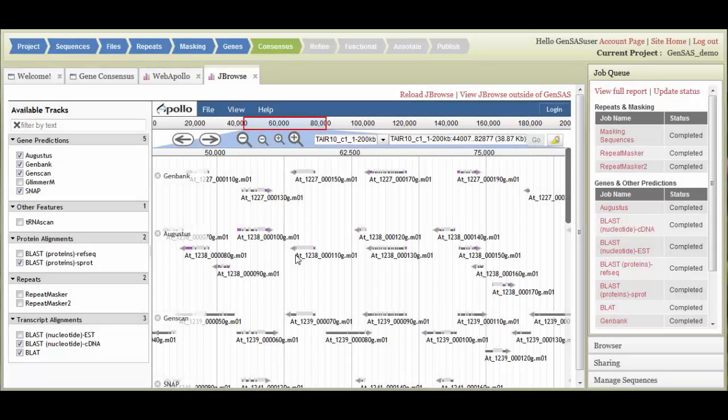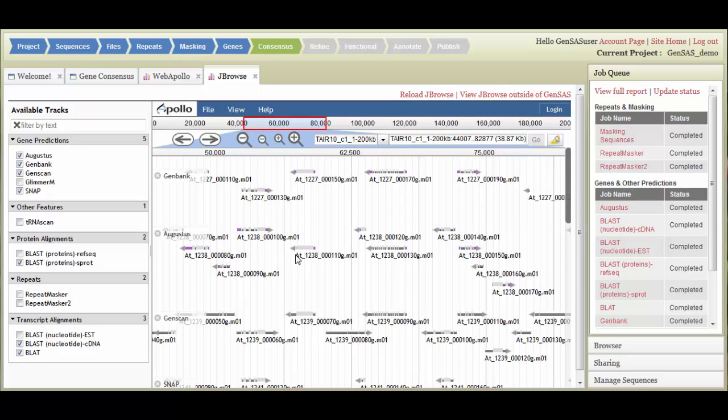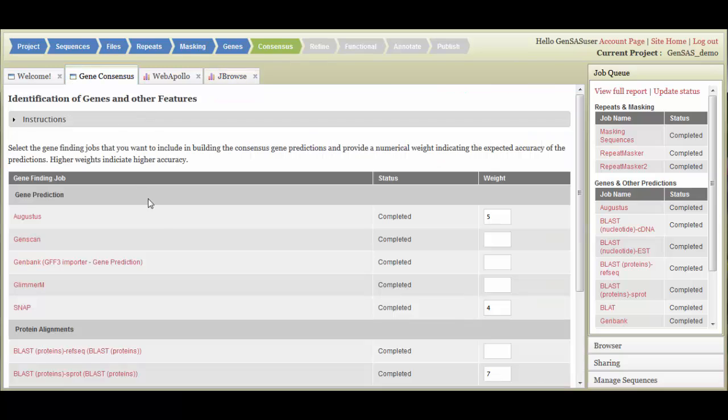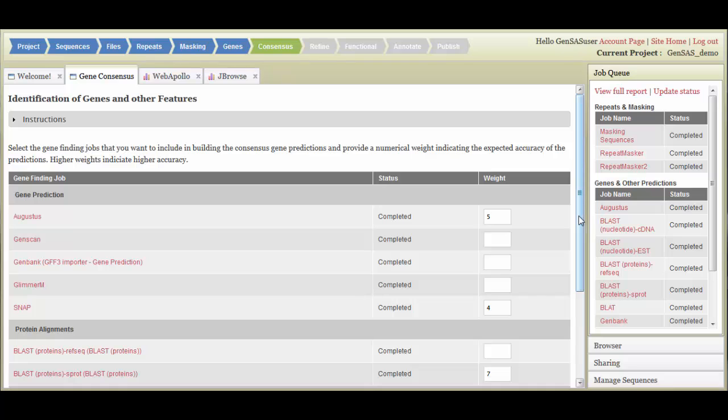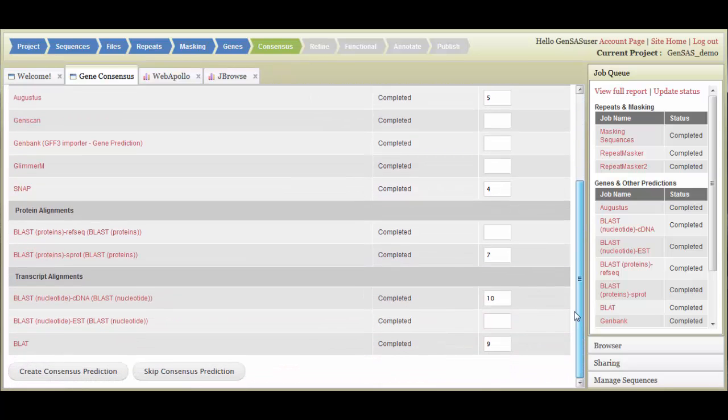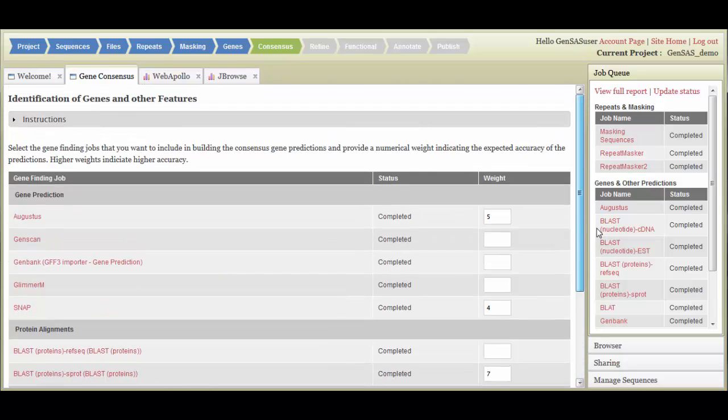Once all of your jobs have finished, and you have looked at the data in JBrowse, you can choose which datasets will be used to create a Gene Model Consensus with Evidence Modeler under the Gene Consensus tab. You will need to decide which data to include and what weight or importance to assign each dataset. Higher values should be given to evidence-based data, like EST and cDNA alignments, and lower values should be given to predictive data, such as Gene Model Prediction tools. If you do not assign a weight to the dataset, the data is not included in the consensus.